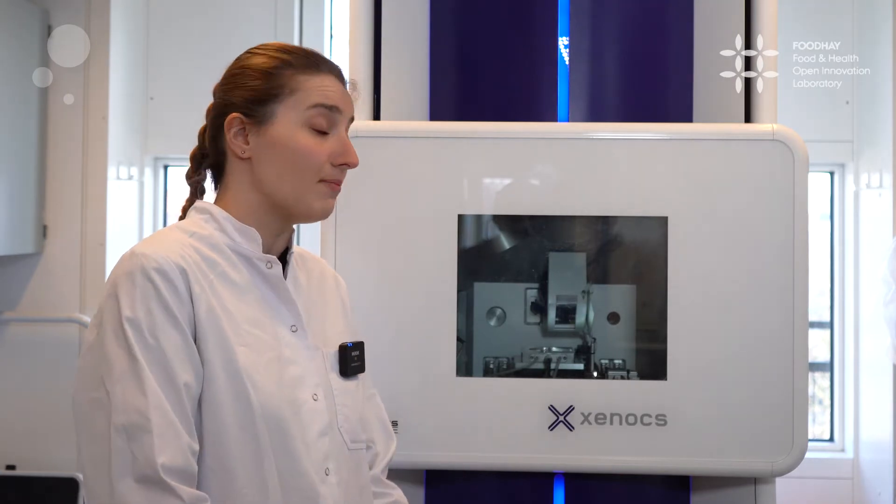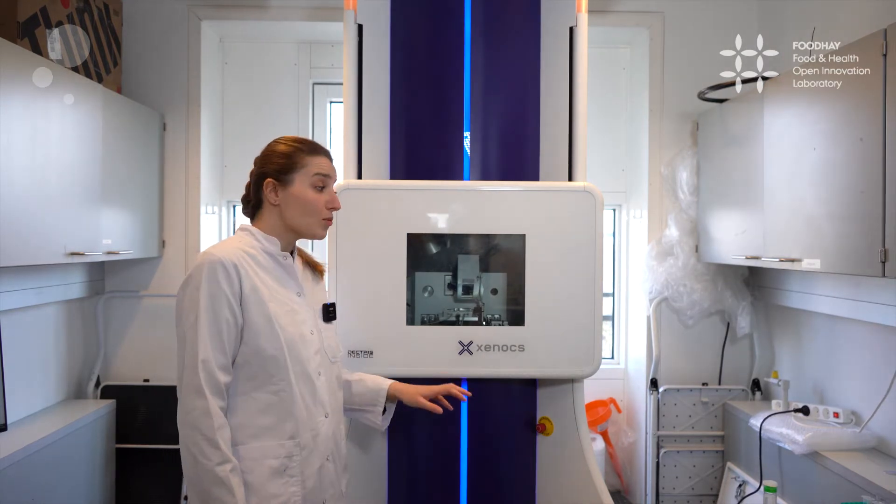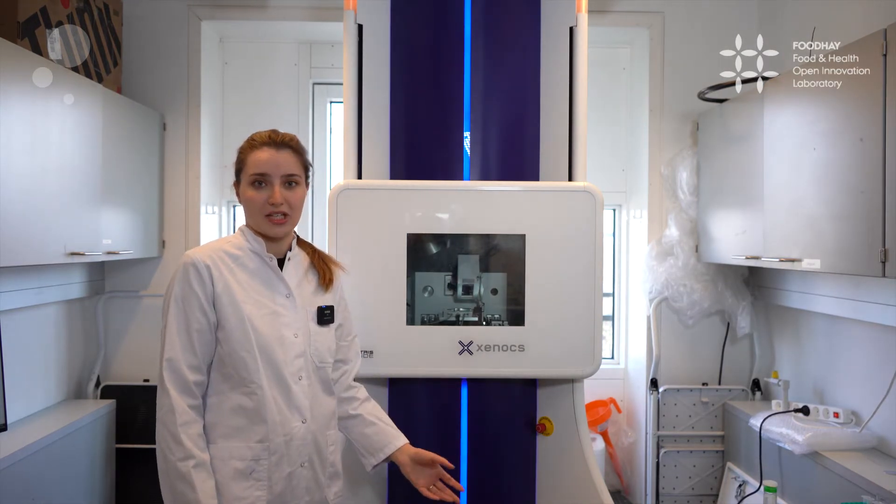FOODHAY is the Food and Health Open Laboratory and it's a Danish initiative that's funded by the Ministry of Education and Science. The equipment here is called the Nano-inXider and it's a small angle X-ray scattering machine.